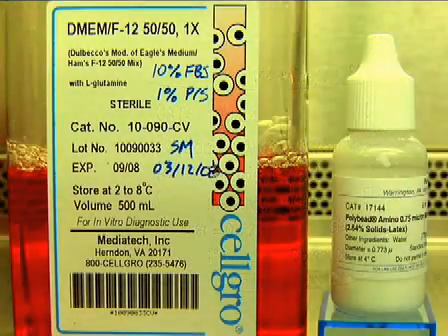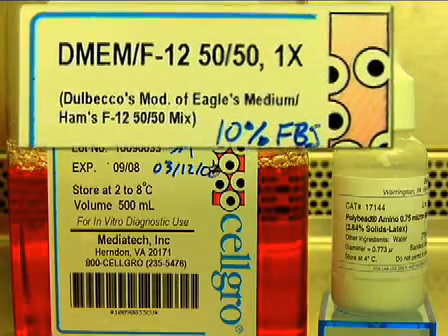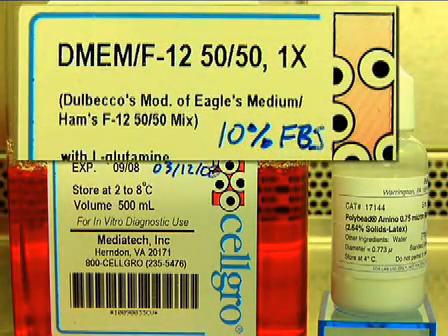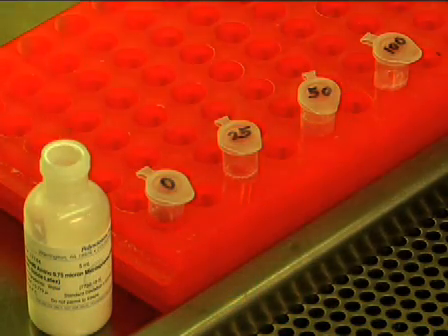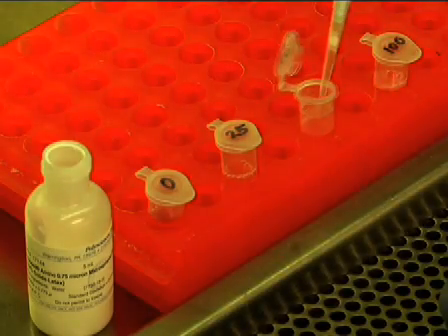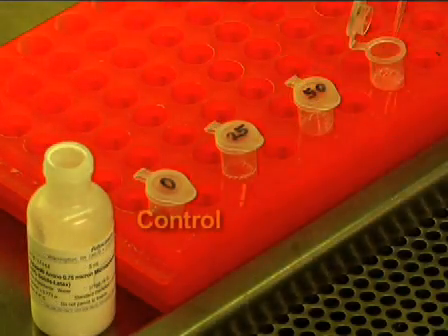To do this, prepare medium B, which is a 1:1 mixture of DMEM and Ham's F12 medium, plus antibiotics and 10% FBS. Then add 0.75 micron latex beads at concentrations of up to 1 mg per milliliter. Of course, every experiment should include controls where no beads are added.